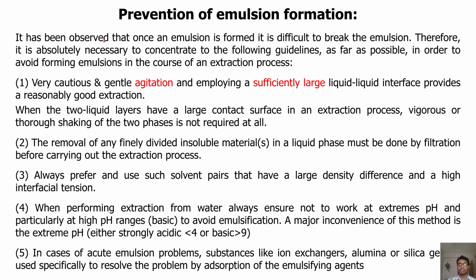Prevention of emulsion formation. It has been observed that once an emulsion is formed, it is difficult to break the emulsion. Therefore, it is absolutely necessary to concentrate on the following guidelines as far as possible in order to avoid forming emulsion. This is the most important thing. Otherwise, you will not have a clear solution.